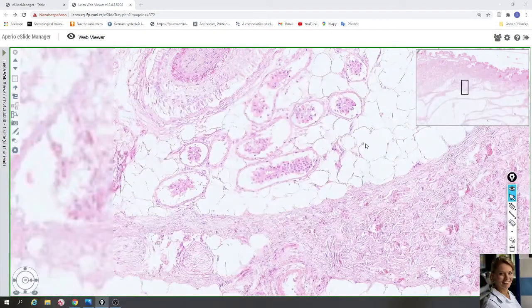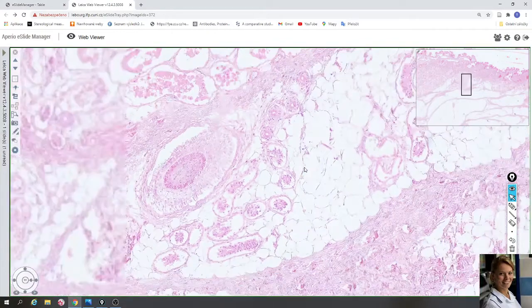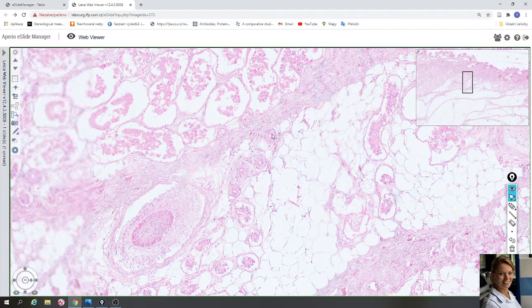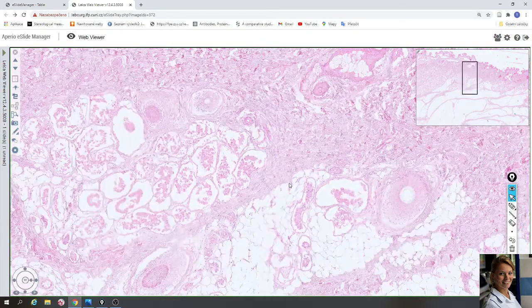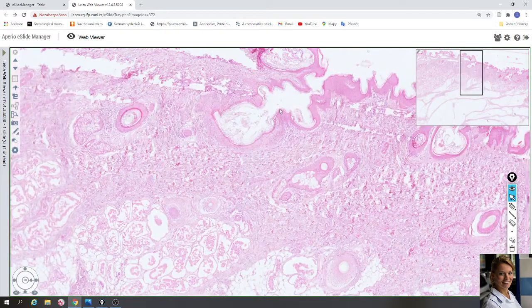The duct of the sweat gland is lined by two layers of cuboidal cells, and the ducts travel through the dermis and through the epidermis to reach the skin surface.